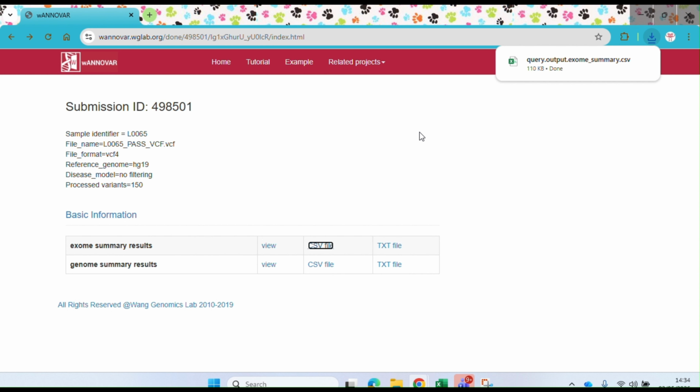I hope I helped you guys understand how to use this ANNOVAR software. And at last I would say that we are researchers, and every day is a school day. We are still learning at this stage, and there are so many things to learn, and so many things to improve.